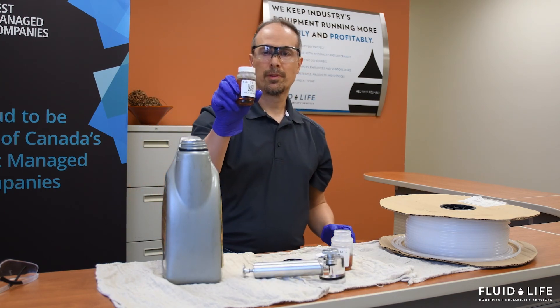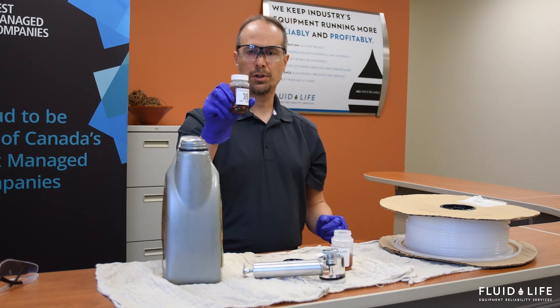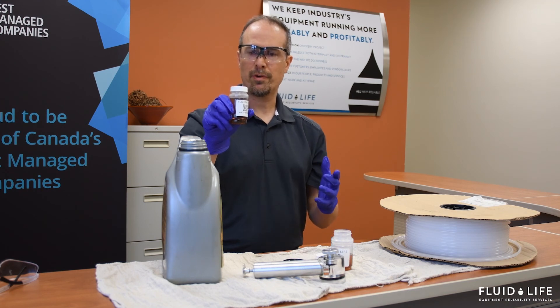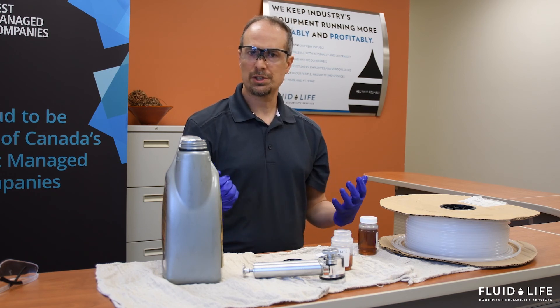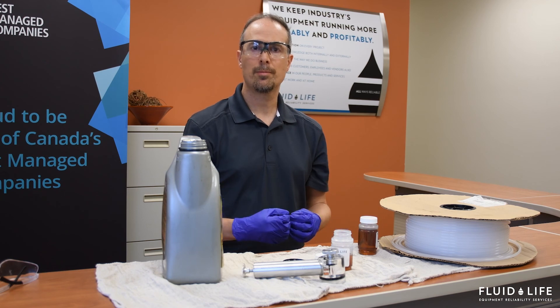Now we have our oil sample. The next thing you're going to want to do is to register the sample, make sure you provide all the information to the laboratory about where this came from, and then you can ship it off. Thank you. If you have any questions, my name is Mark Sherman. Feel free to check out our website, www.fluidlife.com, or give us a shout. Thank you once again.